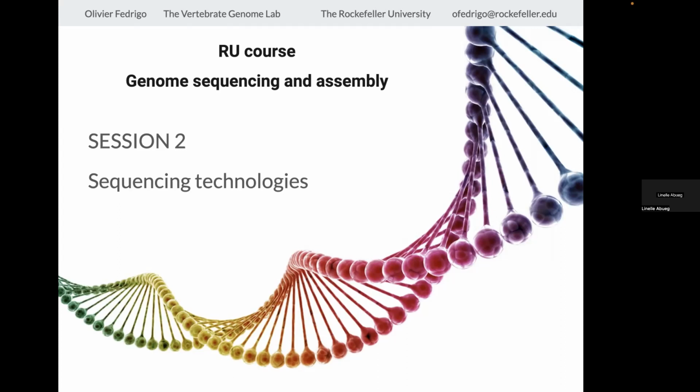If not, yeah, Eric. Well, I think it's good to clarify another reason for why you need coverage, why you need to sequence the genome 30 times over. Not every sequence read you generate, even though it's 99.9 whatever percent accurate, once you have 3 billion base pairs, there's a lot of inaccuracy. So you need to sequence multiple reads and take the consensus of those reads together. And the higher coverage you have, the higher accuracy you get.